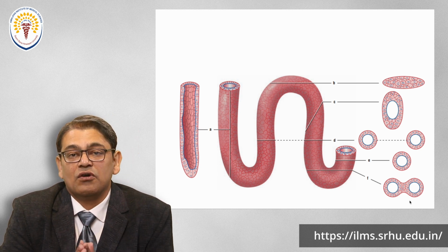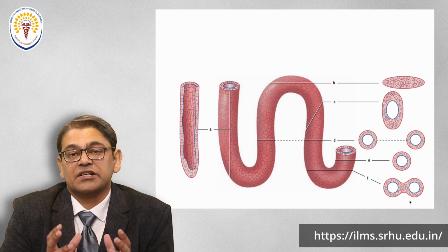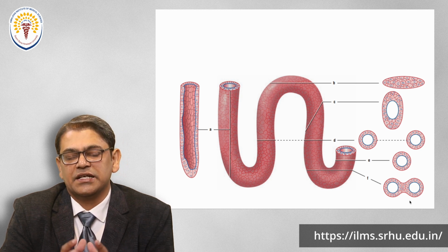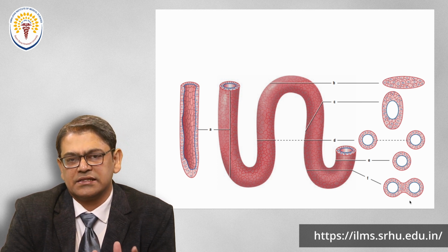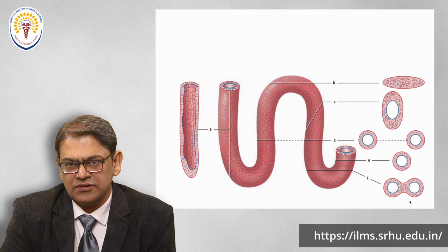So we always have to assume what the probable structure of the tissue could be if you see this section, and make a 3D picture inside your brain, and that comes with practice. So in histology, never comment on a single structure alone, but on what the whole structure is all about.